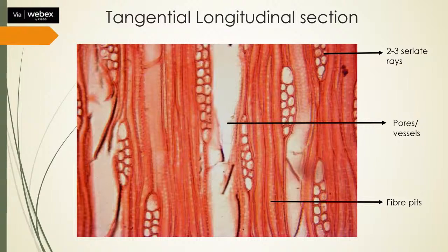Then these are the pores. This is like a tubular structure, and this helps in the conduction of the sap and other things. The two will be connected by the perforation plates. It's called a simple perforation plate. And here the rest of the things are called the background tissues or fiber, and fiber pits can also be seen. These fiber pits are very common on the tangential vessel.